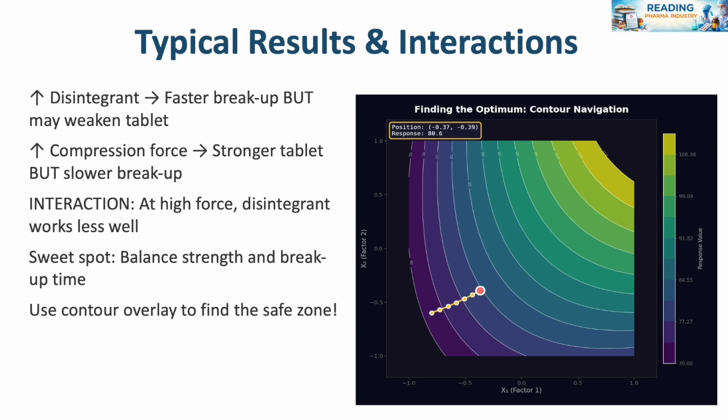One thing we could do to optimize all these properties is, as we mentioned before, to use factorial design and the model-dependent optimization. We basically have a model or equation that helps to understand the correlation between the dependent and independent variables.